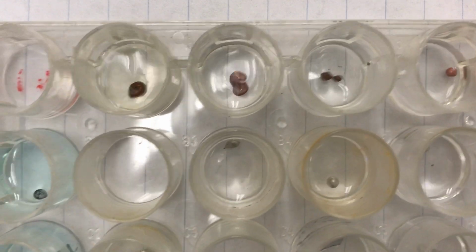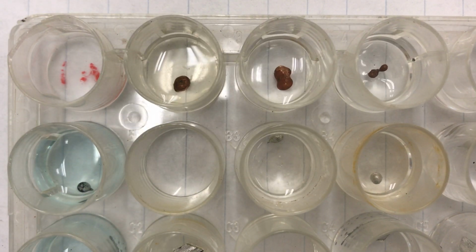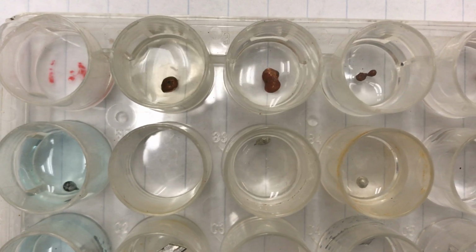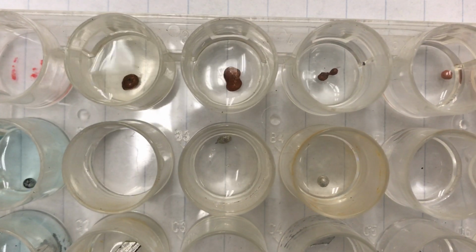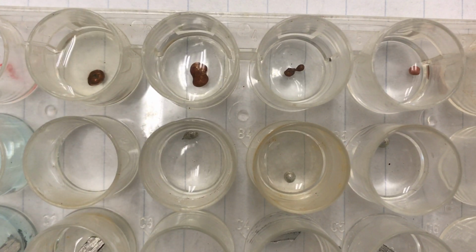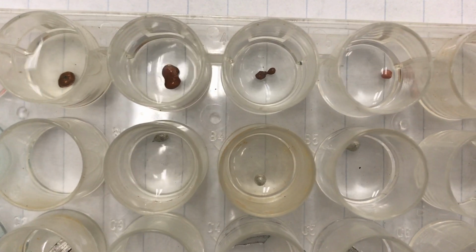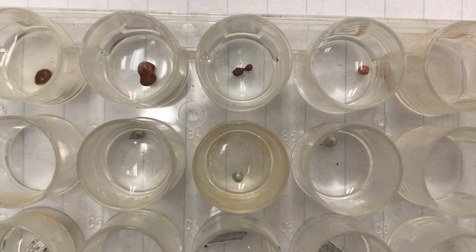Row B, notice any changes that may have happened. Remember, our signs of a chemical reaction are change in color, production of a gas, producing light, heat. That's row B.